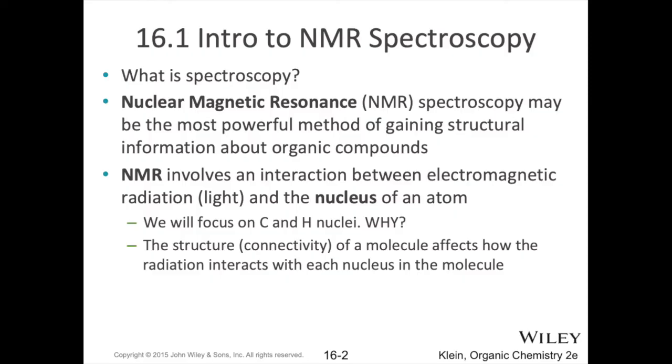Now, why is nuclear magnetic resonance so useful? Unlike other analytical techniques that just tell you what's there, NMR also tells you how the pieces are connected together. You get information about the environment that these different nuclei are in. That tells you what's in their immediate vicinity, and then you can piece together how the different parts of your molecule are connected, and therefore you can figure out the structure of the molecule, which puts NMR way ahead of most other analytical techniques in terms of usefulness.